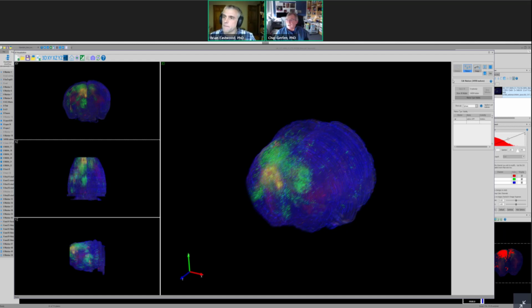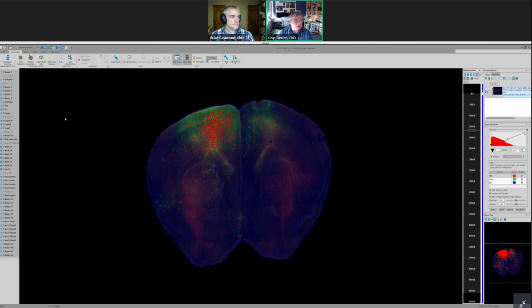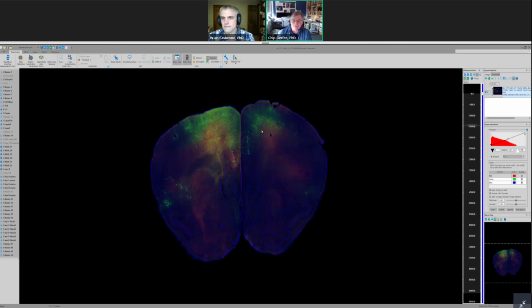Right. Yeah. Okay, so how did we mark these cells? How did we detect these cells? That's what I'm going to show now. They've already been done, but I'm going to go through the process of how we do that. Hide them. And we can step through the different sections, pick a semi-random section that would be good to look at. I've looked at this before. And I'm going to zoom in to this area where there's pyramidal neurons labeled.